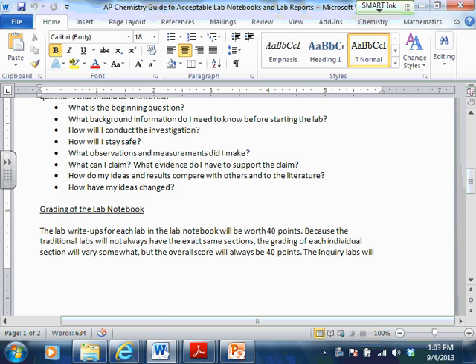Yeah, it would be good practice for you to use sig figs on your calculations, okay? Because in a lab setting, that's actually where sig figs really do matter, right? Because that's when we're making measurements and we don't want our calculations to show a degree of precision that we didn't actually use in the lab, okay? So good question. All right, so that's it for lab number 1. And again, this video will be posted in case you need to go back and reference it while you're doing your post lab, okay?